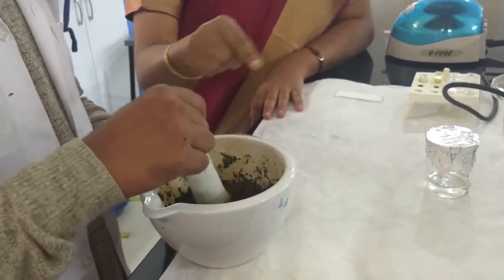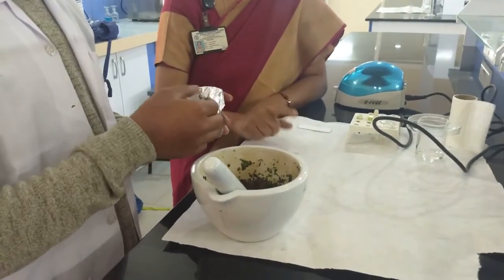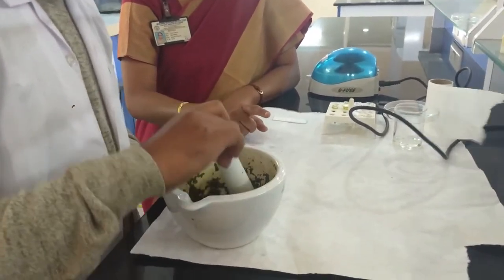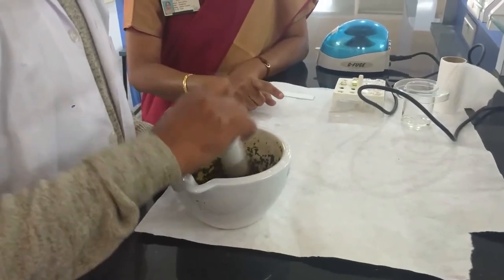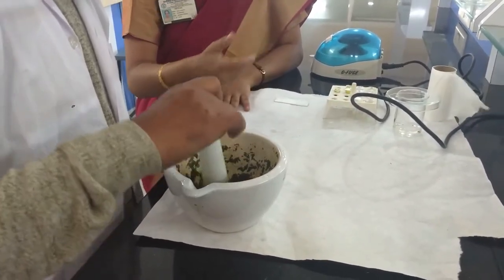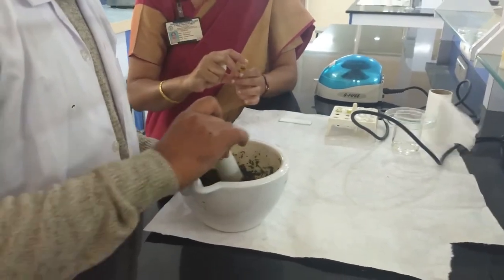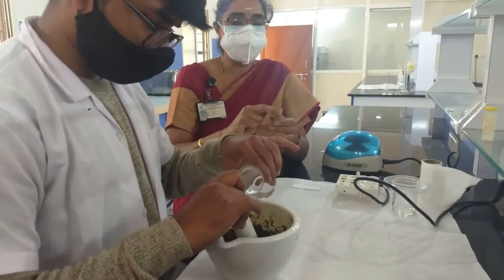Now we are going to add the extracting solvent little by little. For today's experiment, the extracting solvent is prepared with isopropanol, acetone, and ethanol in the ratio of 3:1:3. When this organic solvent is added, the pigments present in the leaves are extracted out and collected into the mortar and pestle. Once ground into a smooth paste, transfer the contents into eppendorf tubes.